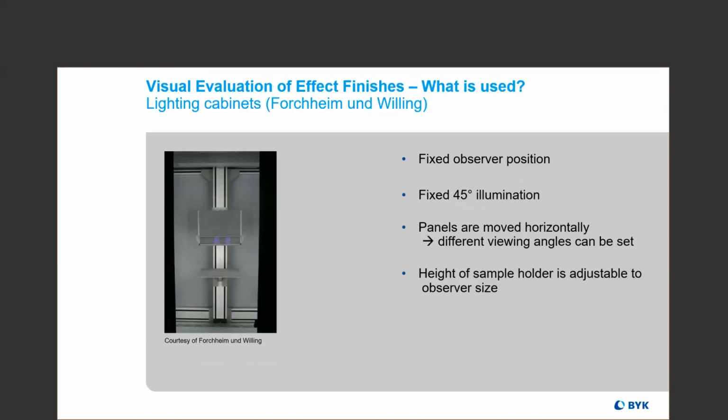Another option is to have a lighting cabinet where the observer's position is fixed and the illumination is fixed, but now the panel is moving through different viewing angles, and these cabinets can be adjusted according to the height of the observer.